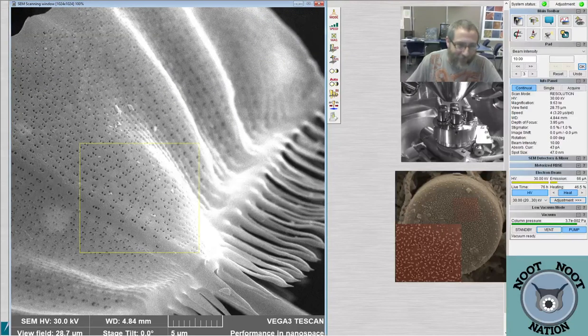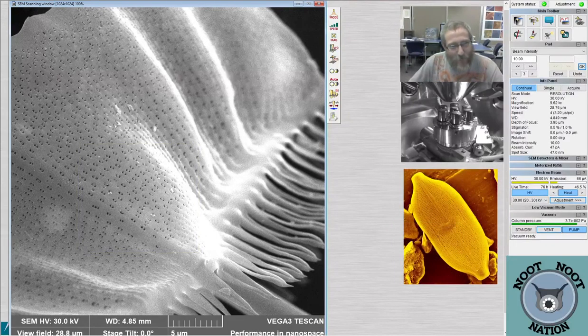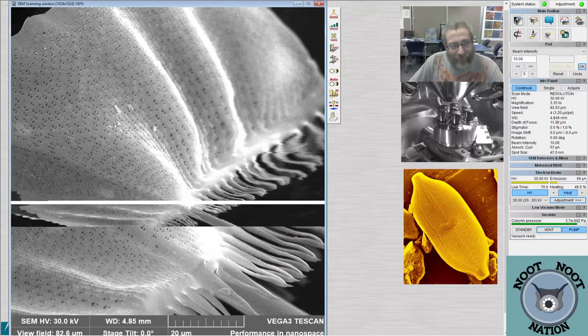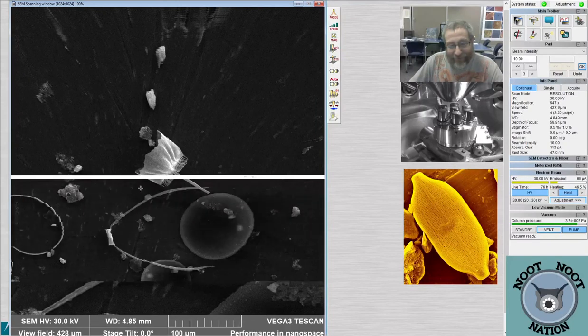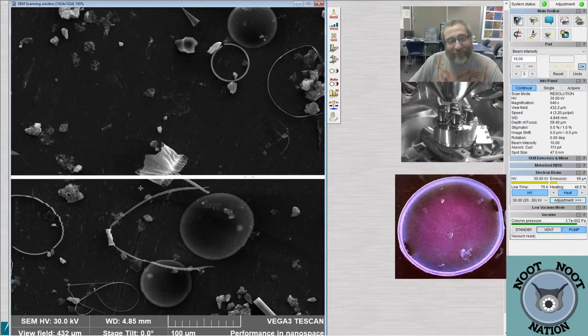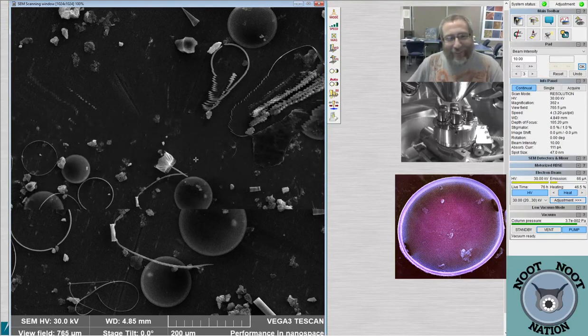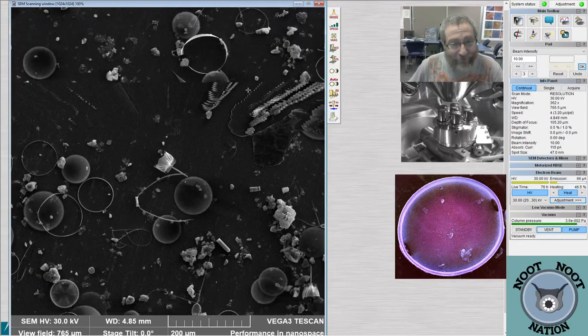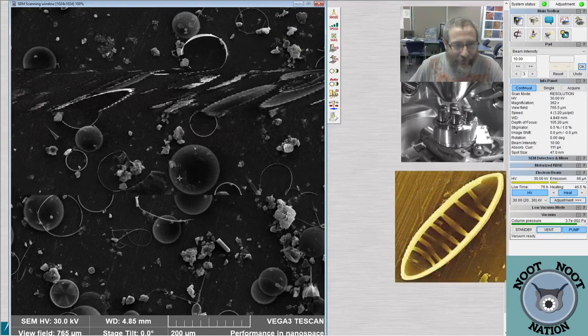Yep. But that's not usually how the SEM works, unfortunately. It doesn't remember where you found things? Like, it doesn't have a favorites for each session where you can geotag things? In fact, it does, if you take a picture. Taking a picture is a good way of telling it that's your favorite. It records X, Y, and Z, and it will drag you back to that same place.